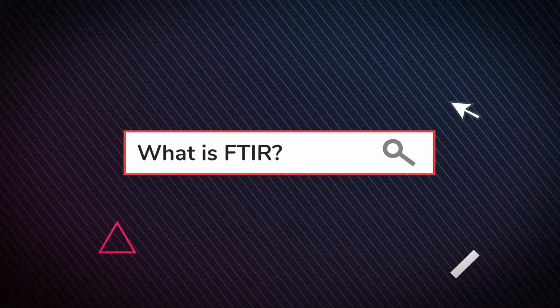What is FTIR spectroscopy? FTIR stands for Fourier-transform infrared. It's a type of light technique where you have the full range of the light spectrum directed down to a sample. The spectra you get at the end can be in either absorption or transmittance, though fundamentally they tell you the same thing.